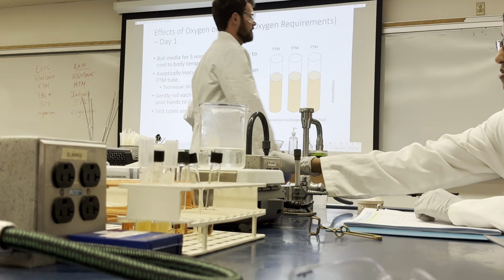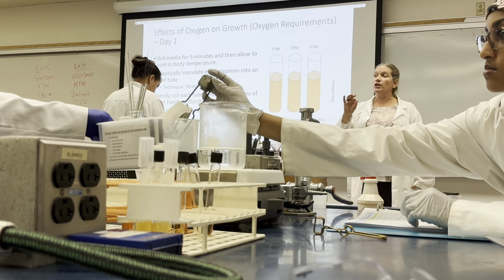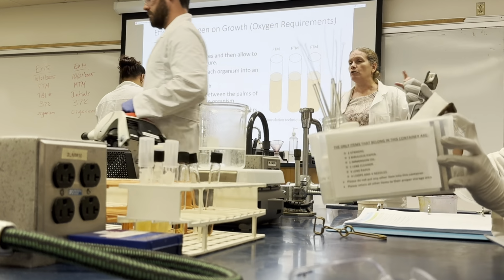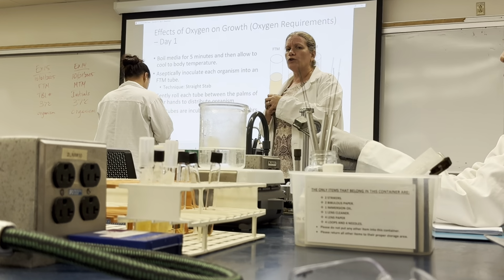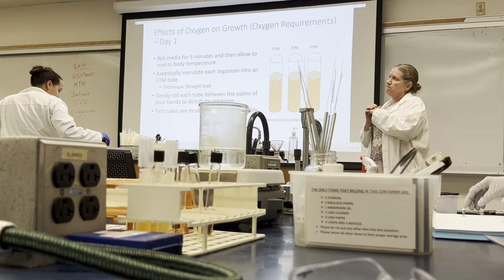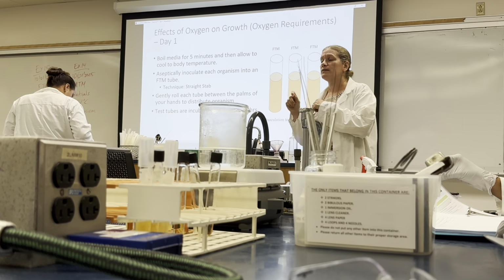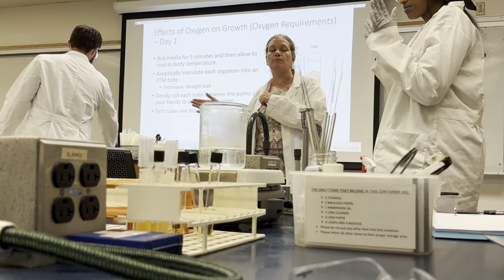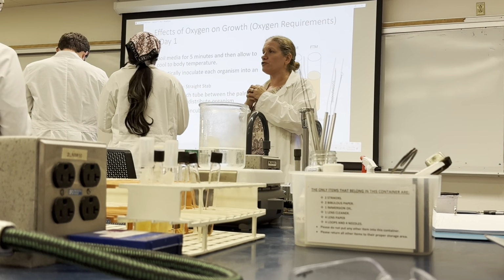I'm just going to remind you, wet mount slides go into the bleach bucket. The cultures at the table, once you're done with all the cultures at the table, you remove the label as best you can, and put it on the kill cart. If you haven't already, turn off the water bath, the hot plate, and unplug it. Other than that, the transfer pipettes, you can temporarily put them into the bleach bucket, but before you leave for the day, make sure you get those transfer pipettes into the biohazard.